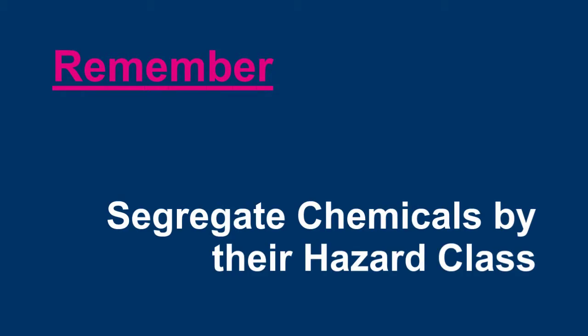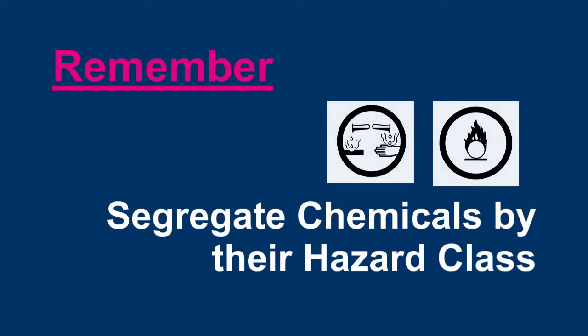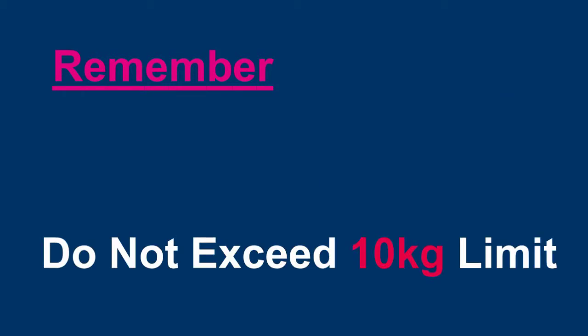A few important notes. For safety reasons, please segregate chemicals by hazard class. Do not mix chemicals from different hazard classes in the same package. Do not overpack your waste. Make sure it does not exceed the 10 kilogram weight limit. When you have a heavier load, consider splitting the chemical material into smaller and different packages. This will minimize the chance of lower back injuries to our ESF workers.